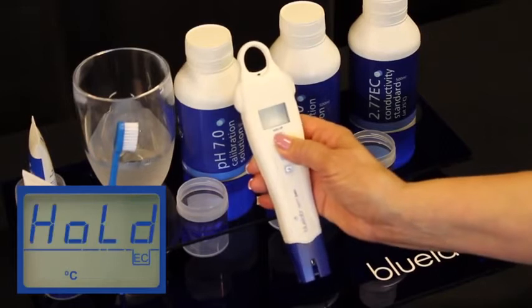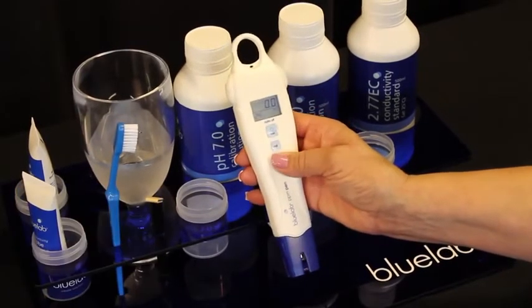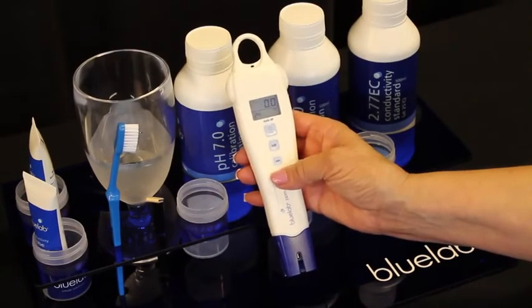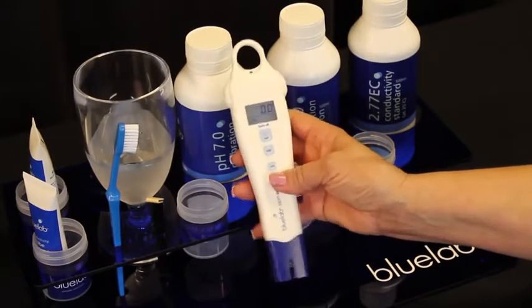One short press of the on/off button to make it hold, and once again to take it off hold. Your Bluelab PPM Pen has a units button which gives you the ability to change your meter to the settings you prefer.